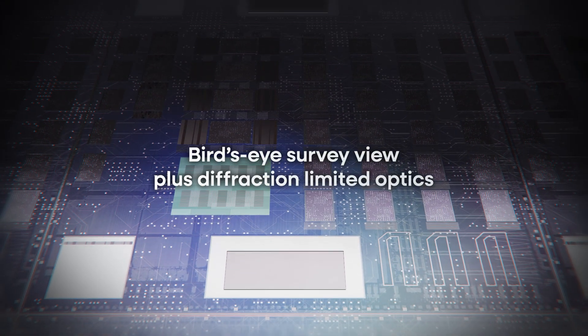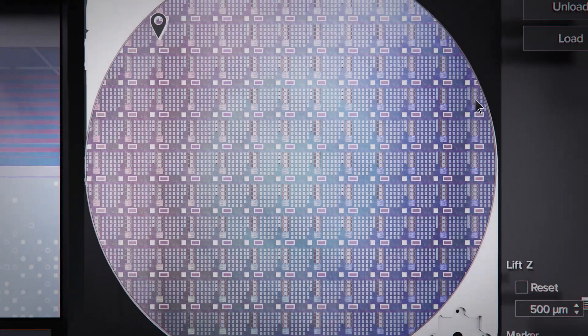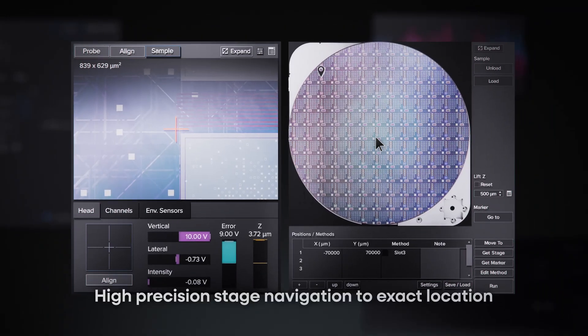A bird's eye survey view camera provides a comprehensive view of the 200mm wafer, facilitating easy navigation to target measurement points.